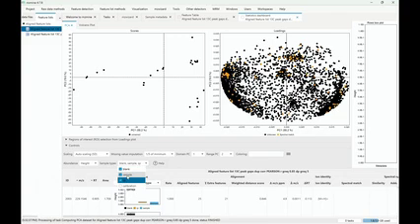And of course, you can provide metadata, so you can overwrite this and just say this is actually blanks. If we do so, we see that there's actually clustering happening. And also in the coloring here again, we can type in condition. And in there, we have also the media, the QC, and the two strains of our Pseudomonas.